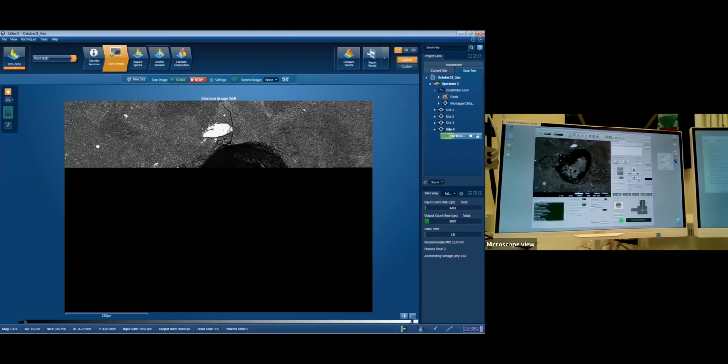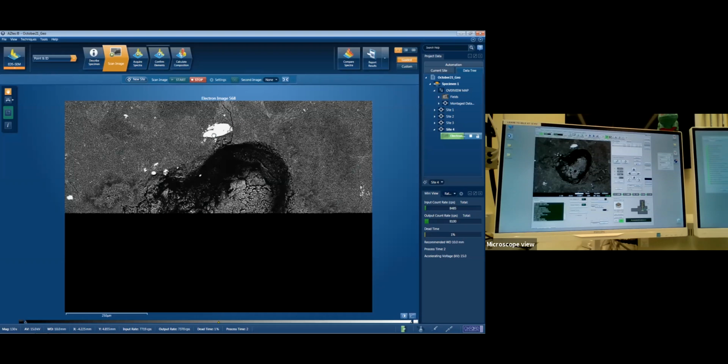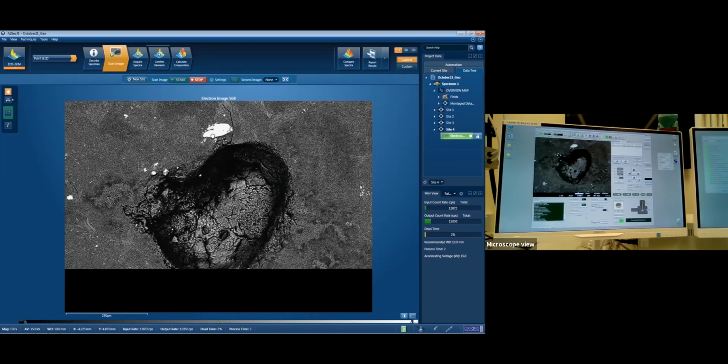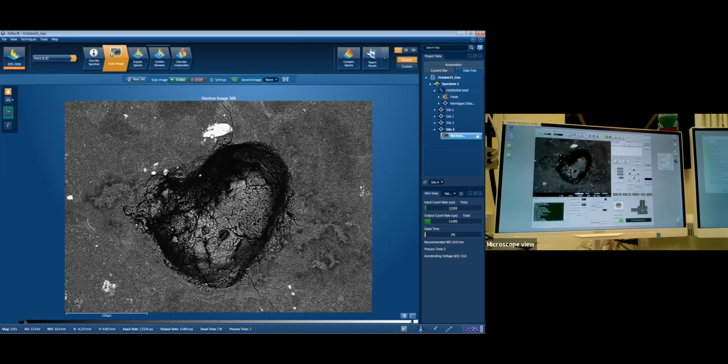And what we can see already is we've got this really weird sort of gritty texture almost. And then also probably preferentially being polished down when I polish. So I polish the sample. So that blob in the middle is probably somewhere. Yeah. That mineral is probably a lot softer than the stuff around it. So it's just preferentially getting removed as we polish it along to get it to a flat surface.